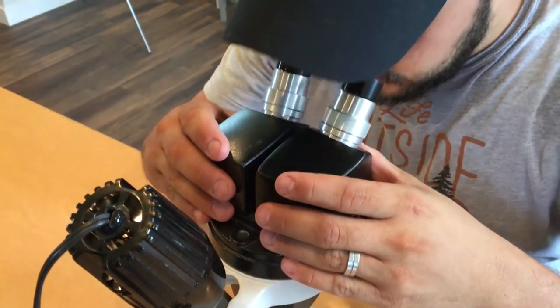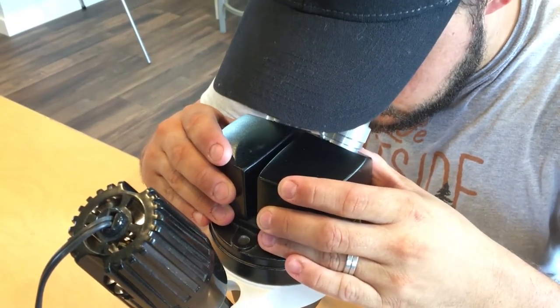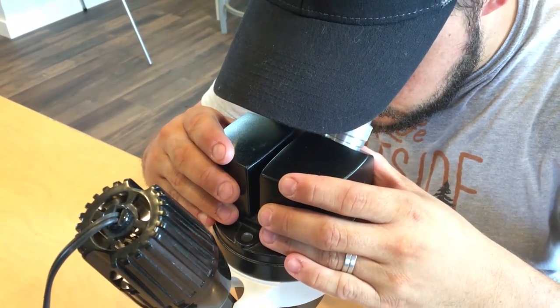That's all you really need to know about operating the student microscopes in IPM House. You're now ready to see features on these little insects that you may never have seen before.